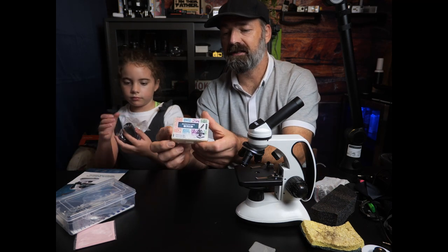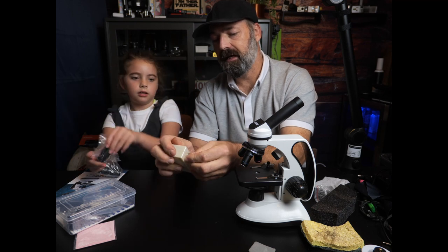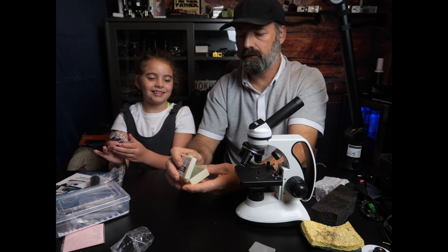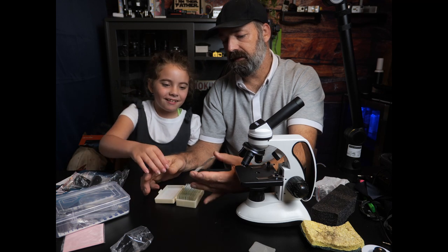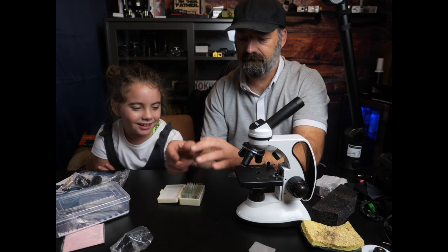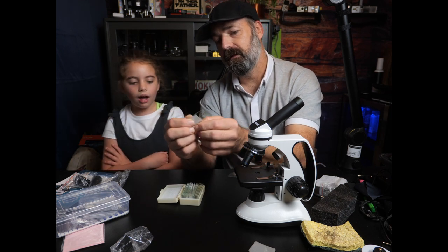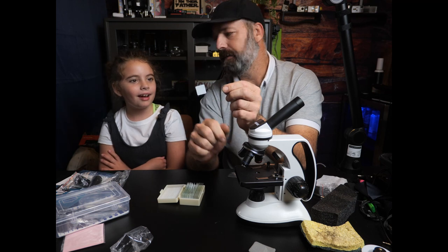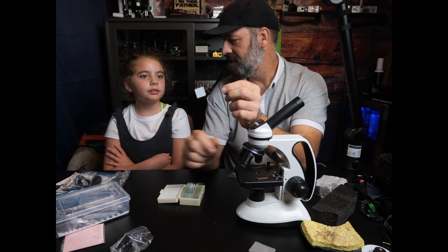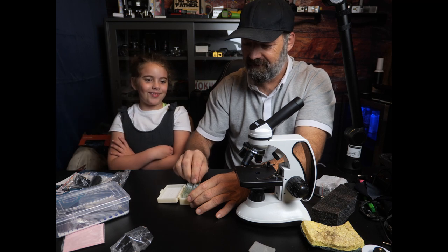You get a box of slides and lens. What's cool about these slides, Lizzy — they're glass. They give you clean glass slides, but they also give you pre-loaded slides with stuff already on them. This one is a honey bee's leg with pollen on it. Can we see that? How cool is that? I actually never saw a bee's leg.